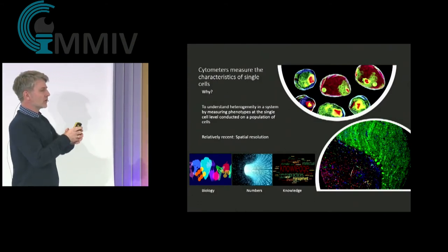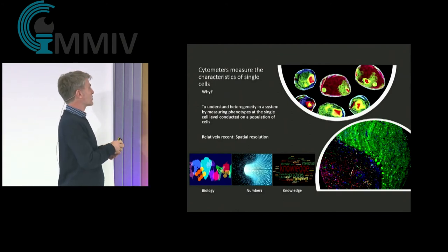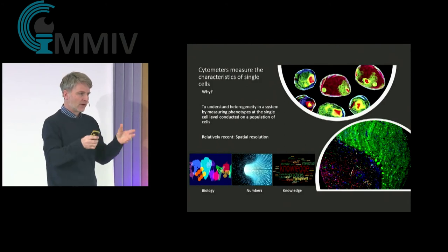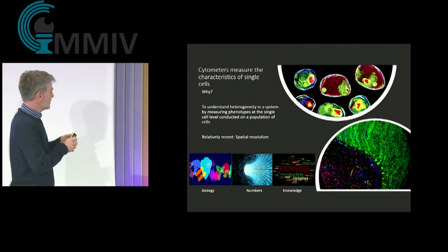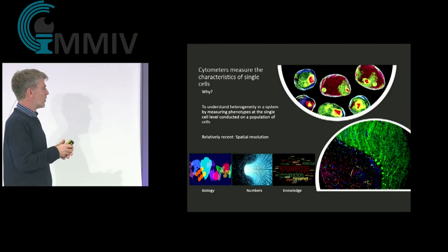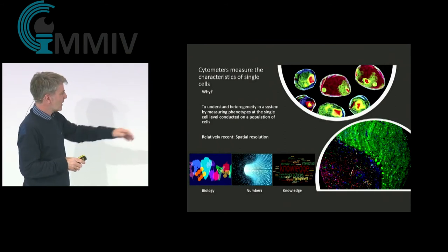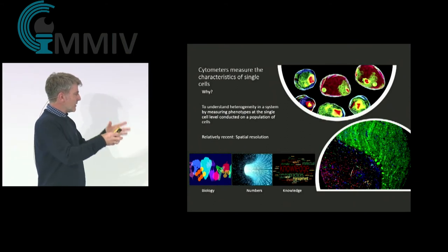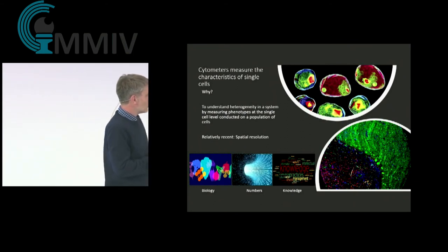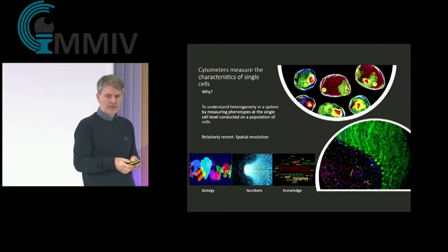I think it's so cool that you can use this technology of imaging mass cytometry and also look at the same thing as a cytometer does, measure like a whole cell. And again, the spatial resolution from looking at that tissue, like down to the left here, right, I mean, you can take it all apart, and you can apply back the cells that you are interested in.